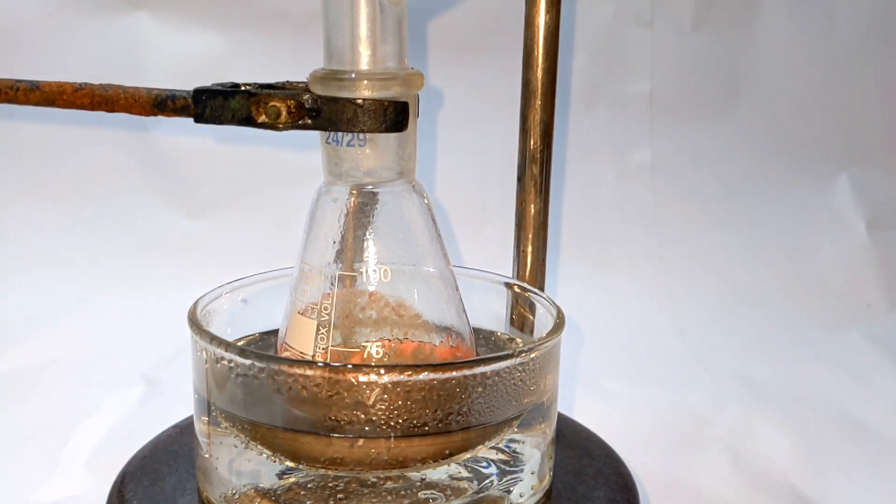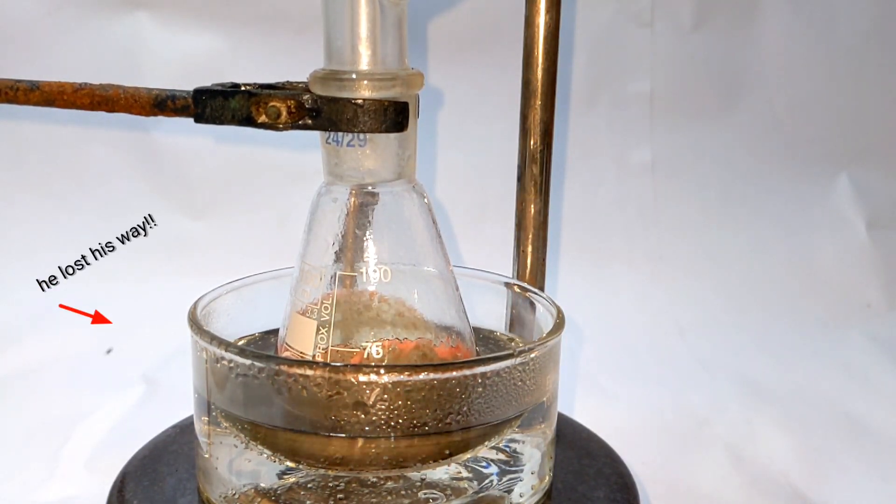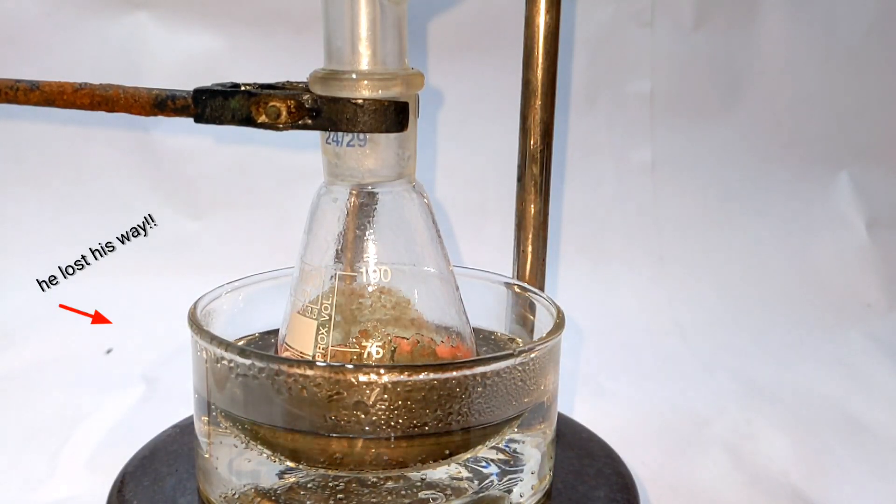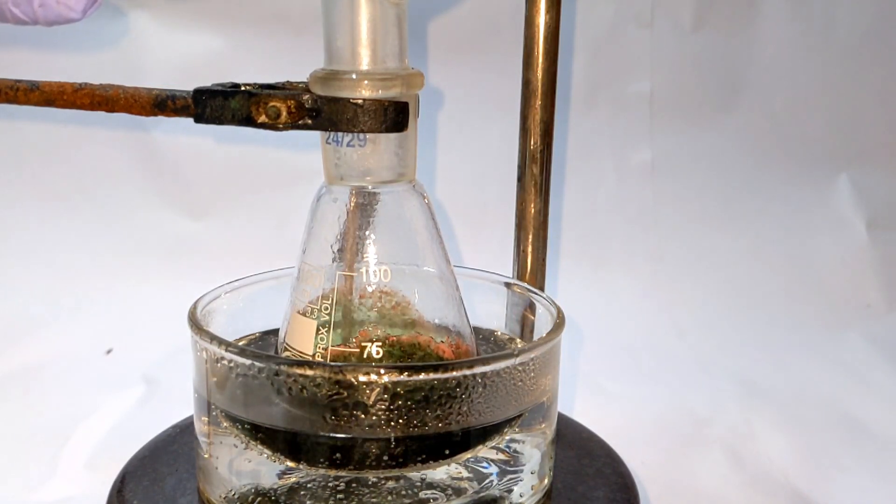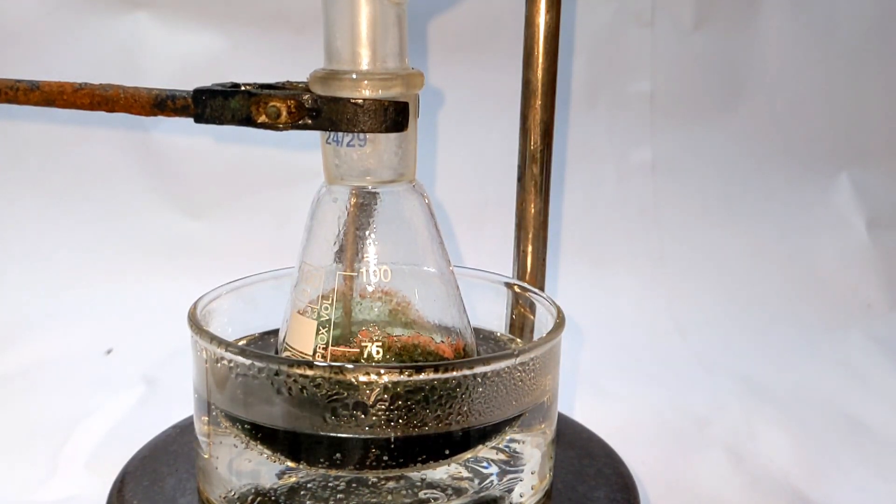You immediately see the color turning dark green and a glistening black colored precipitate is formed. And this is the product Cobalt-Acetyl-Acetonate.